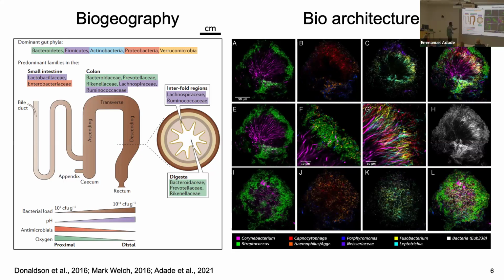In the oral microbiome space, where this image is coming from, the oral microbiome is really accessible. People could take dental swabs and image them, and start seeing at the micron scale specific microbe interactions that exist in these oral cavities. And in this image from Jessica's lab, they start really unraveling specific microbe interactions shown here in different colors. Each microbe has a relationship that allows it to interact effectively with another microbe to form these really conserved structures that were studied in the human microbiome. And these are profound for understanding how the oral microbiome is established and how changes in the oral microbiome can lead to disease and illness. So we have the tools that allow us to really start mapping specific microbe interactions at the micron scale within this microbial world that exists within us.